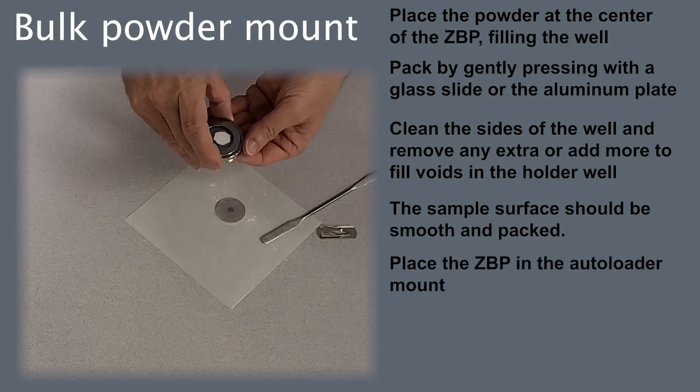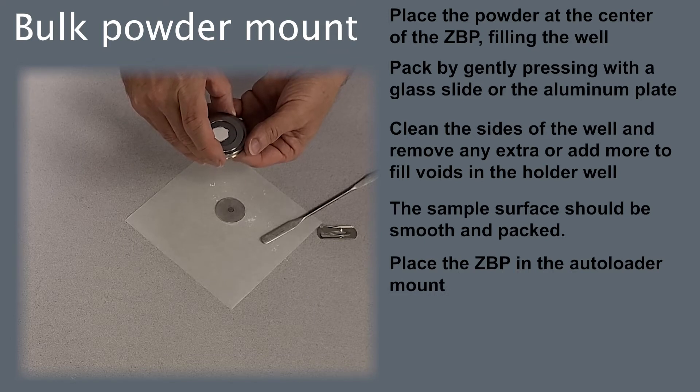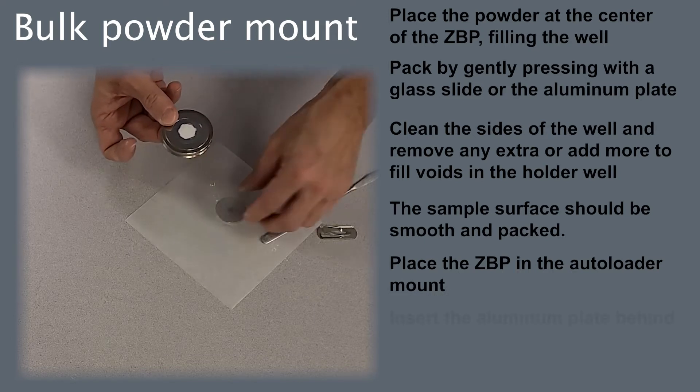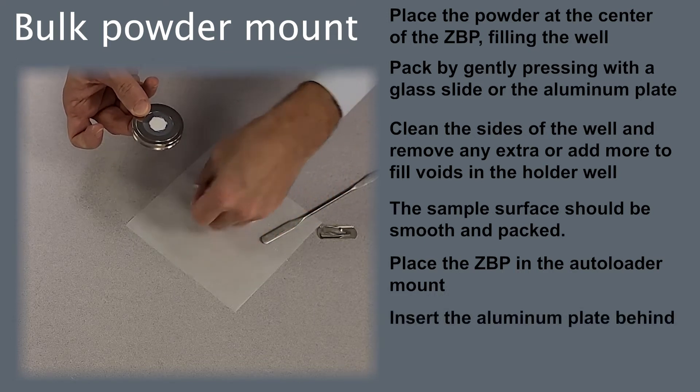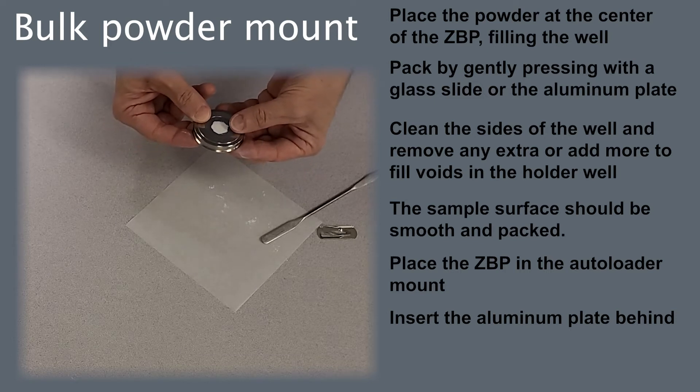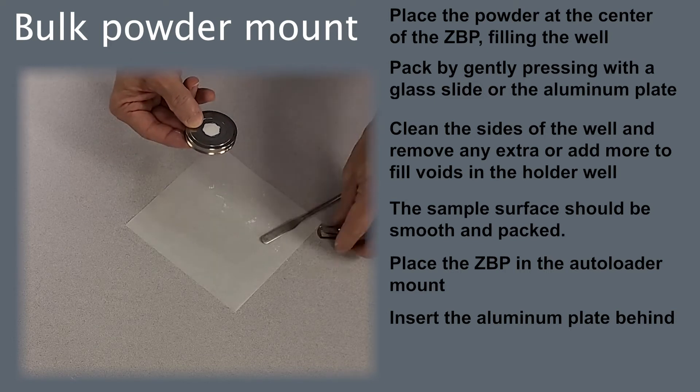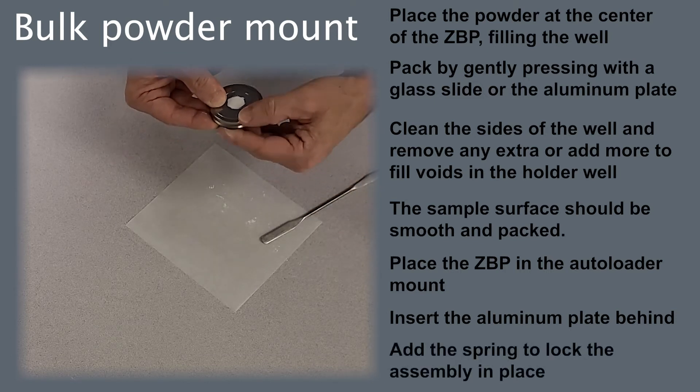Place the sample plate in the auto-loader mount. Place the aluminum plate behind. Place the spring and lock it in place.